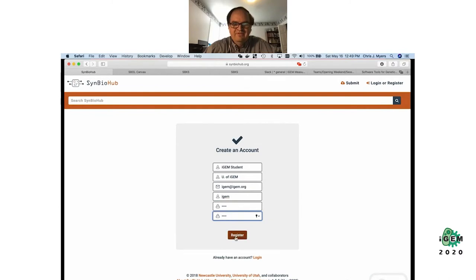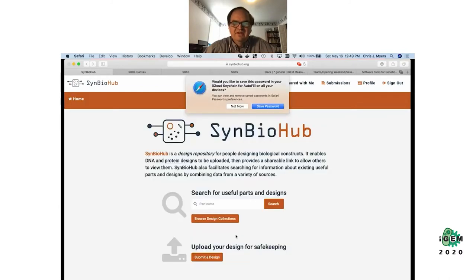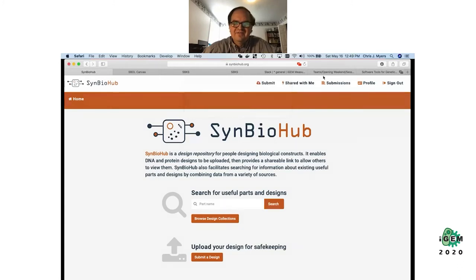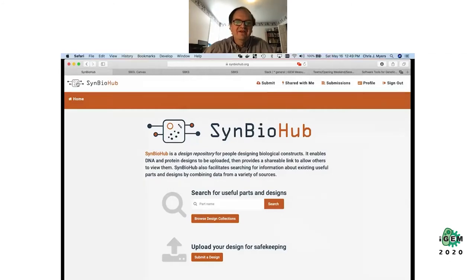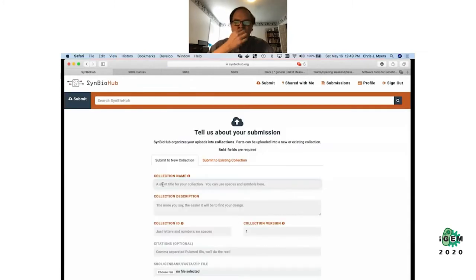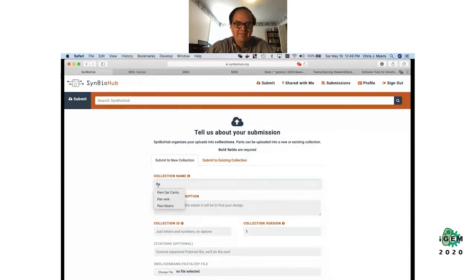Now I've created an account and I'm going to want to create a shopping cart, if you will, for the parts that I'm going to use in my toggle switch design. So I'm creating a collection and pressing the Submit button.